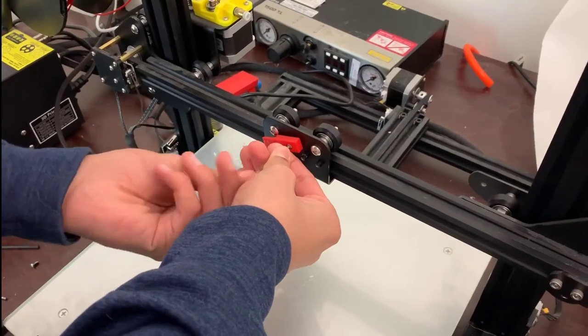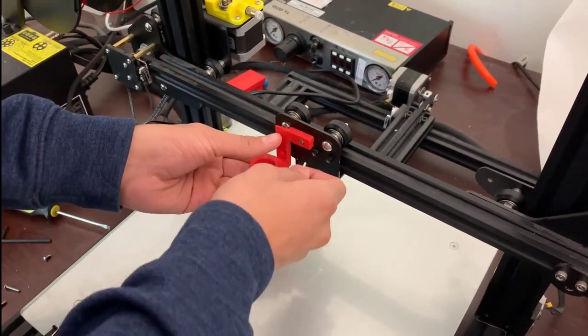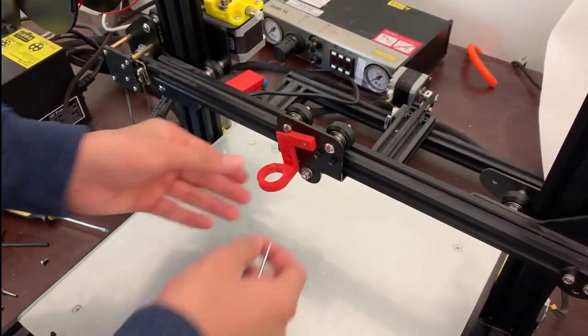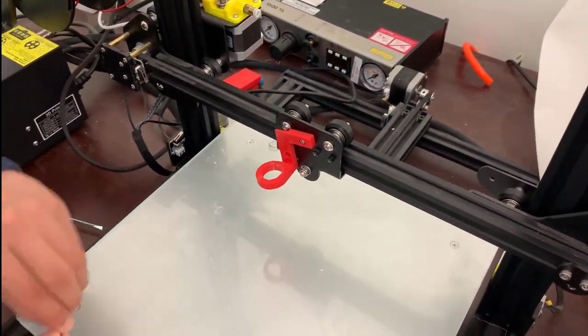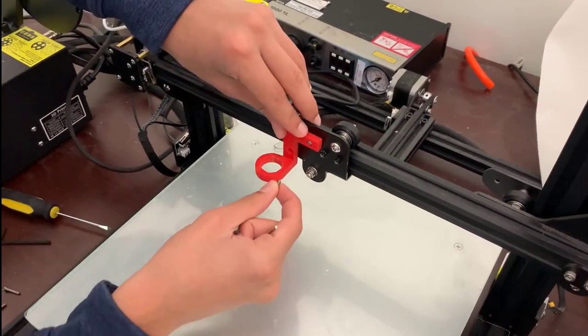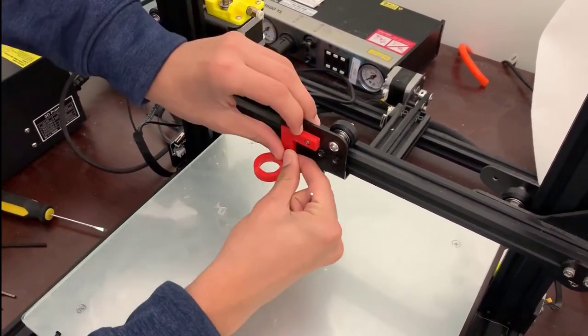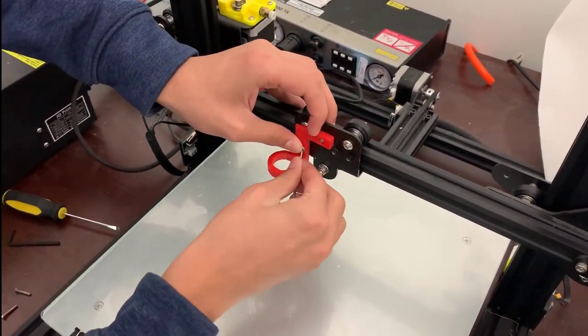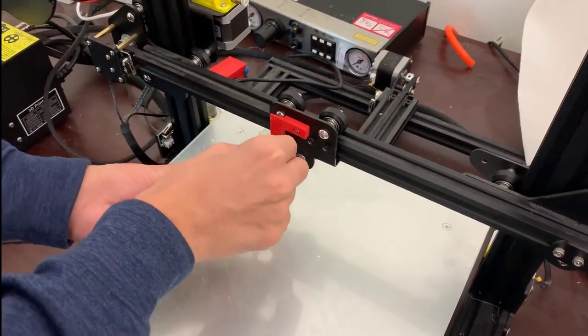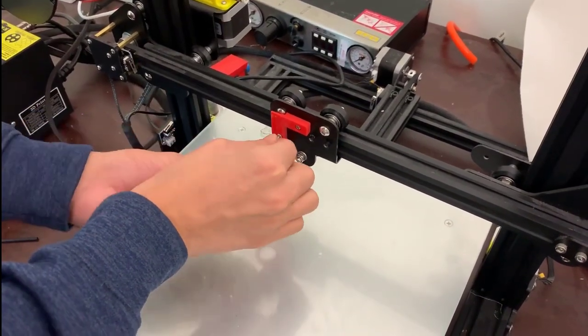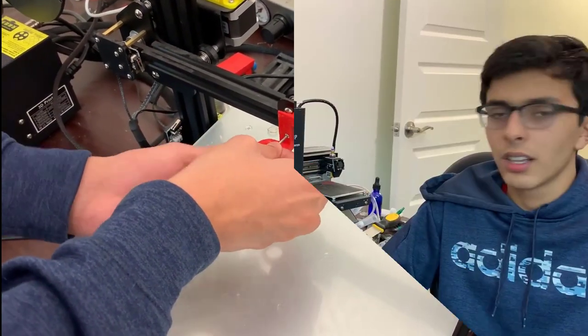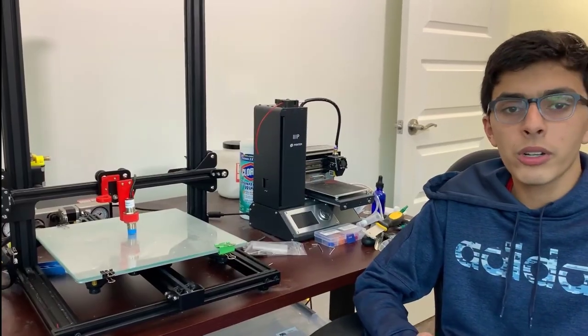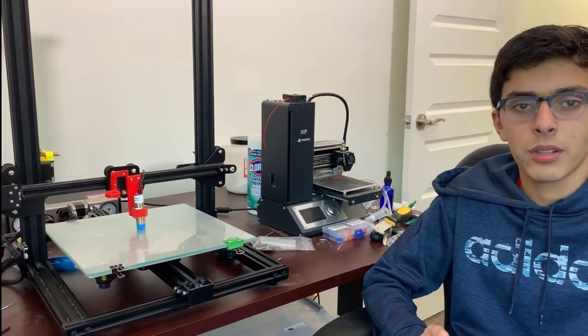The final step in setting up our bioprinter will be screwing in our 3D printed syringe holder. We're going to be using the screws that we removed from the actual extruder and it will essentially be taking its place. So now our printer is almost ready to print biomaterials.